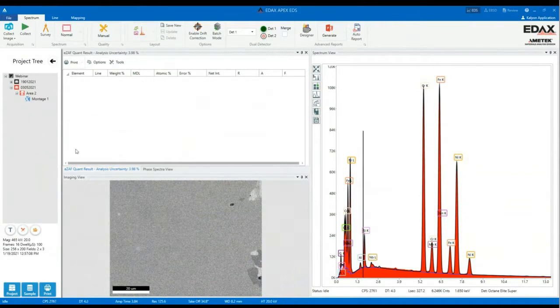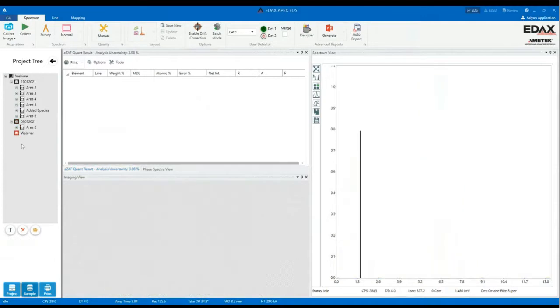All the data you are measuring in the software are stored in the project tree. When you want to create another subgroup in Apex, it is called a sample. Then you go over to sample, type in the name of the sample and click OK. When the sample or the subgroup is highlighted red, then this sample or subgroup is active. All the measurements you are doing will be stored in this subgroup. By doing a right click, you can delete or rename the sample. If you have done measurements on it, you can go here and delete some of the measurements you have done, for some reason.